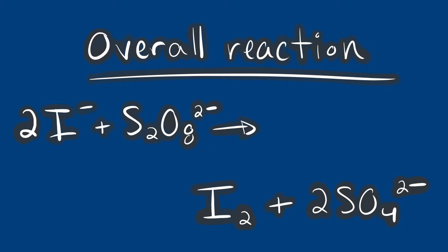There are no phases included here. Every phase that we're going to be working with is aqueous. There's no gases, no solids being produced, so keep in the back of your mind, aqueous conditions will be here.